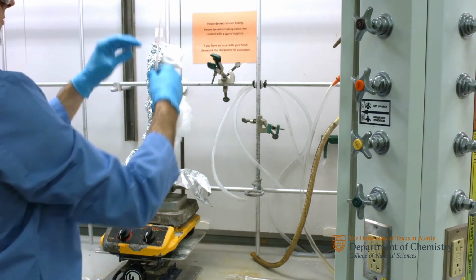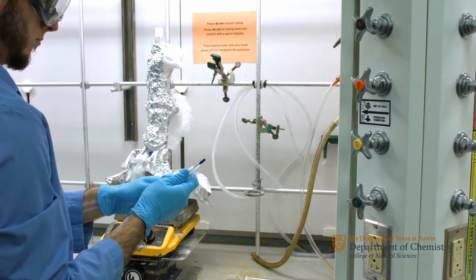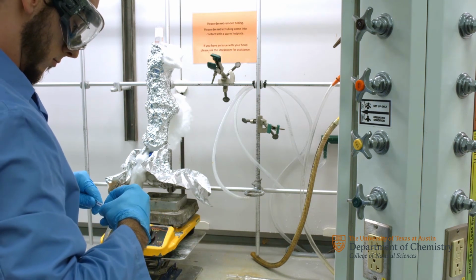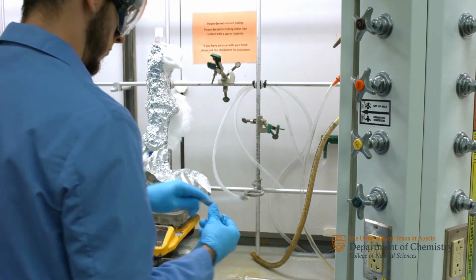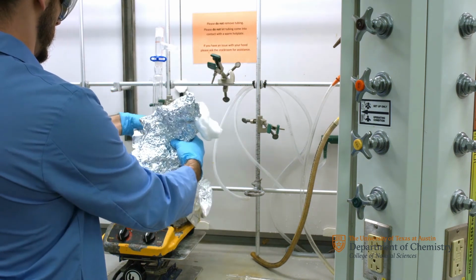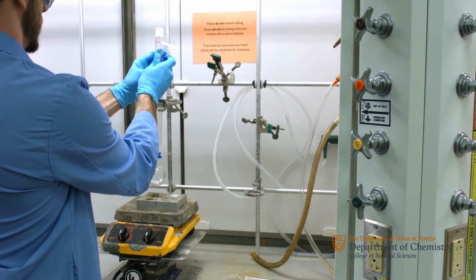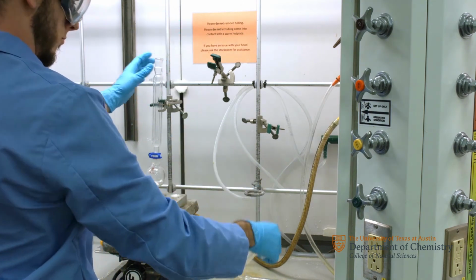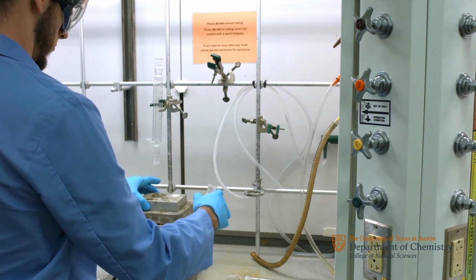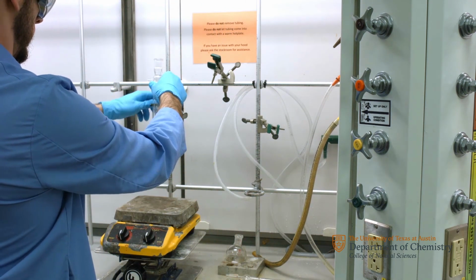Now remove and disassemble the thermometer adapter. Remove the aluminum foil and cotton. Then remove the distillation head, followed by the distillation flask. Finally, take down the distillation column.